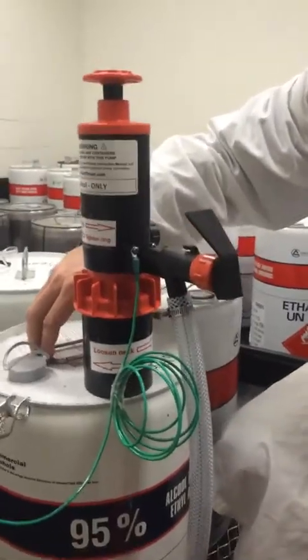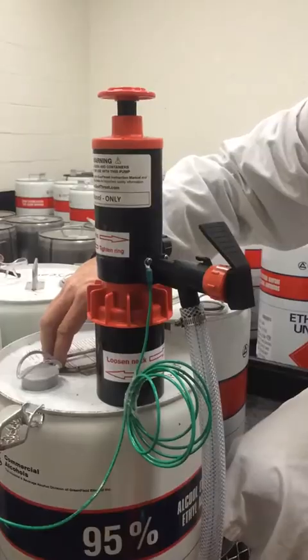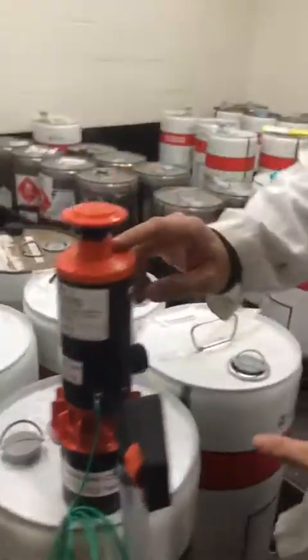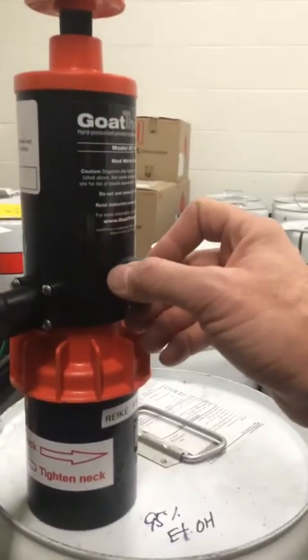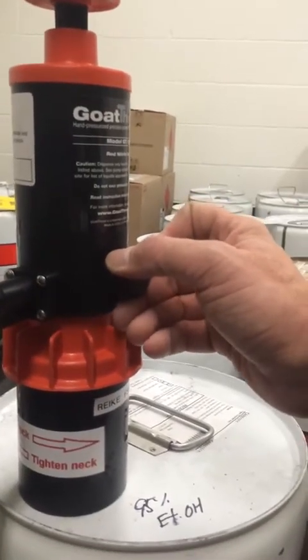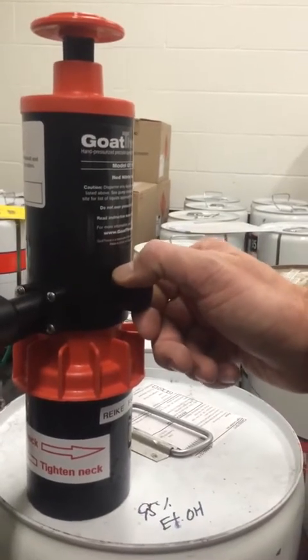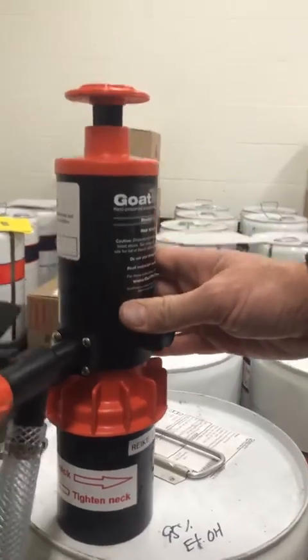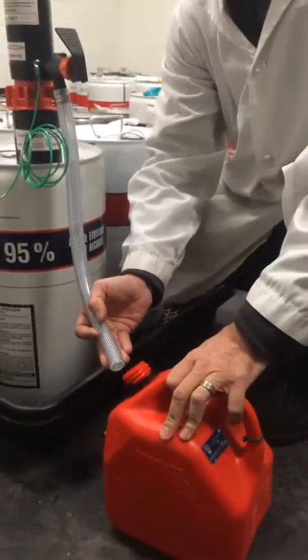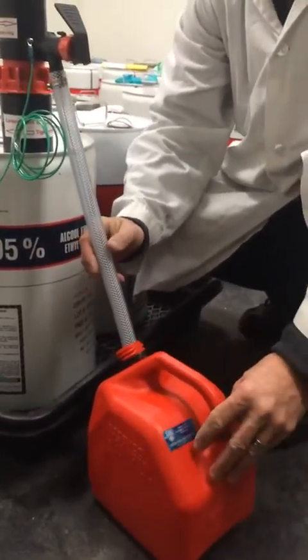At this point you're almost ready to dispense, but first you need to close the pressure valve on the pump itself. There's a small black knob — turn it clockwise all the way, righty tighty, and that closes the pressure relief valve in order to charge the pump with pressure. Then take an appropriate secondary container and put your dispensing hose into it.